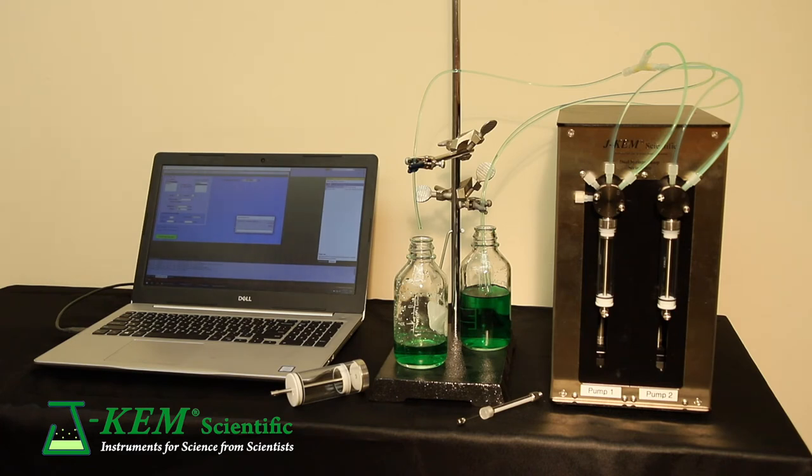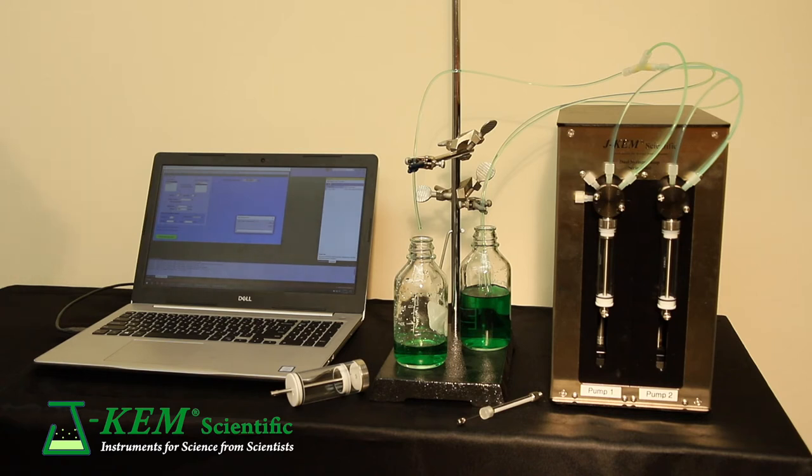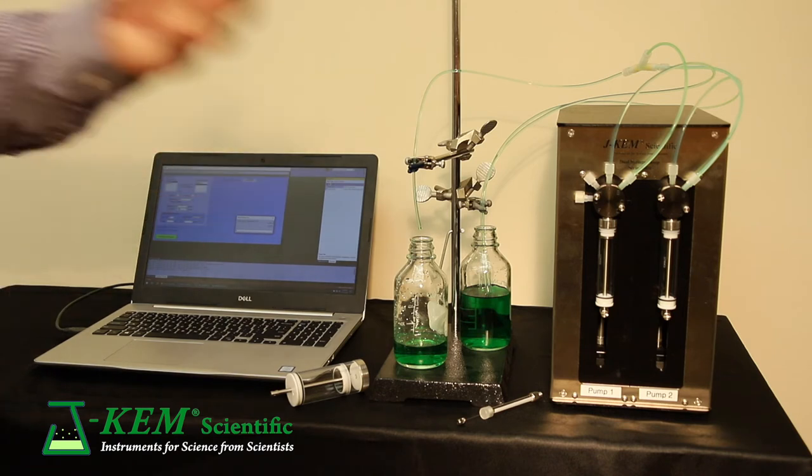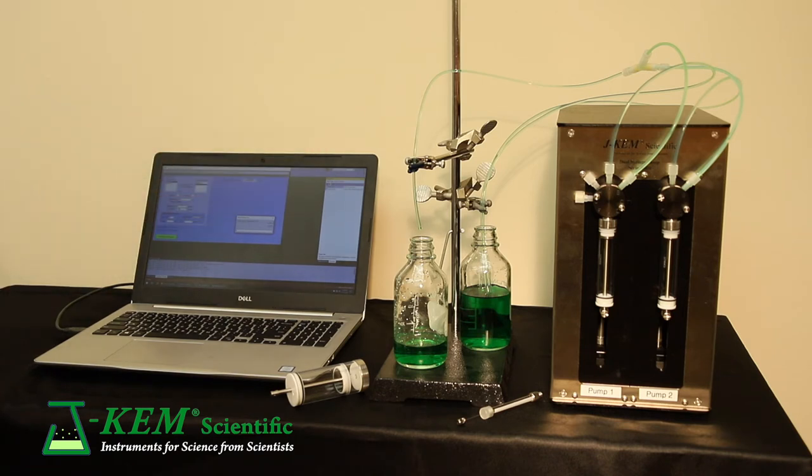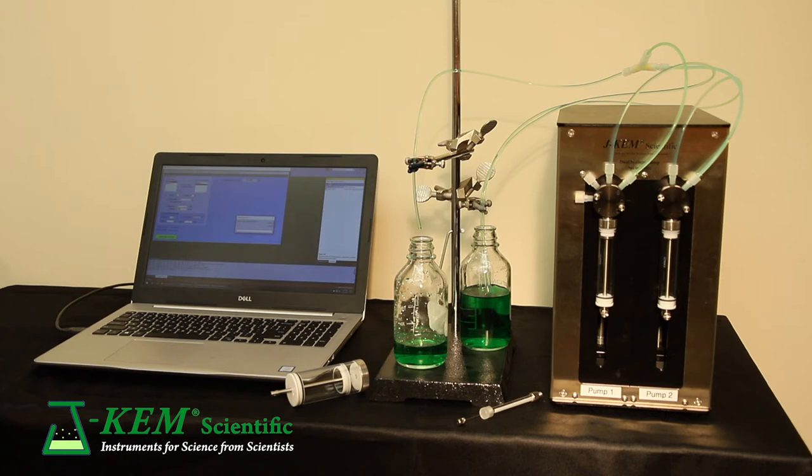So the key points on the equipment side are that the pumps are completely inert, nothing but glass and teflon. They have an incredibly wide flow range from 3 nanoliters a minute up to 750 milliliters a minute, and extraordinarily high precision. That syringe is divided into 3 million steps. So even with a 10 milliliter syringe, you can reproducibly add microliters of solvent.